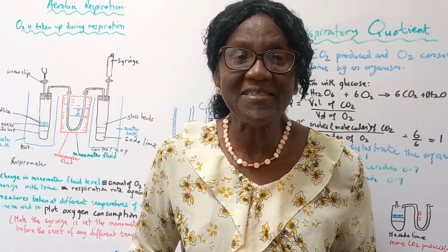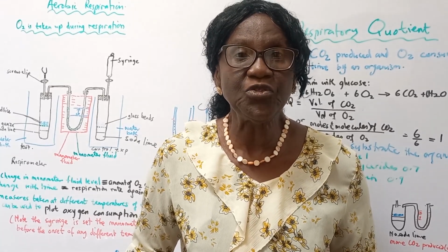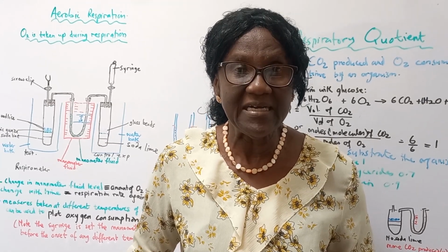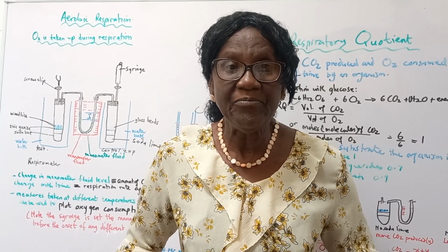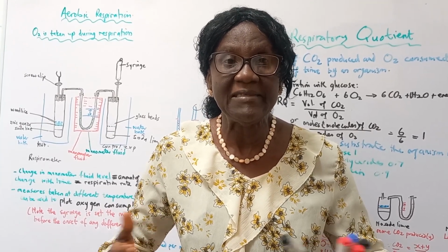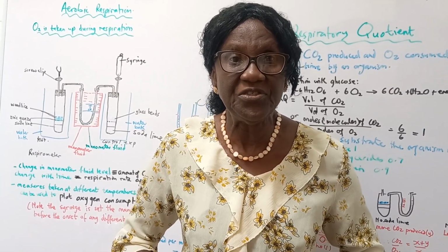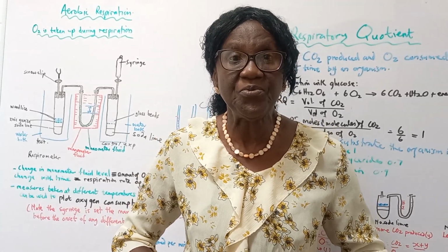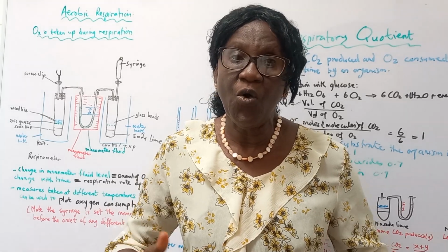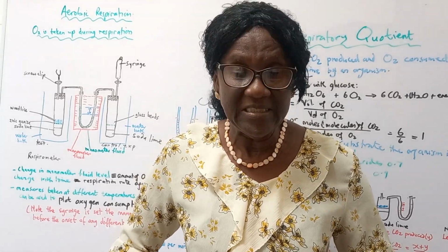In today's lesson, we are discussing how to use the respirometer to measure the rate of respiration with time, the rate of respiration under different temperature conditions. We'll use the respirometer to measure the respiratory quotient. We'll also look at the calorimeter.